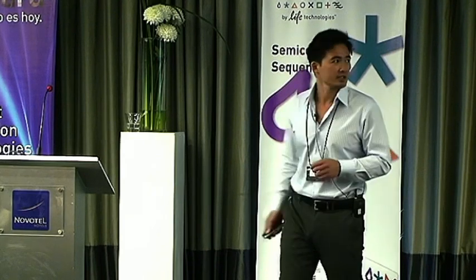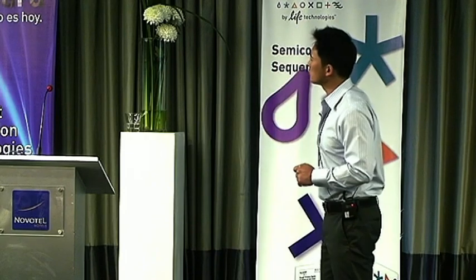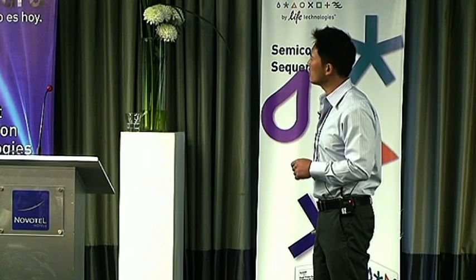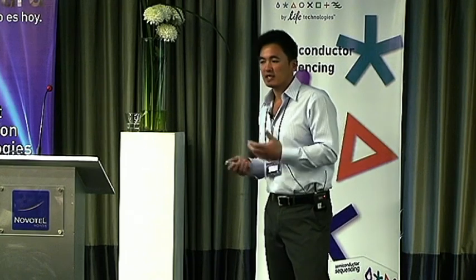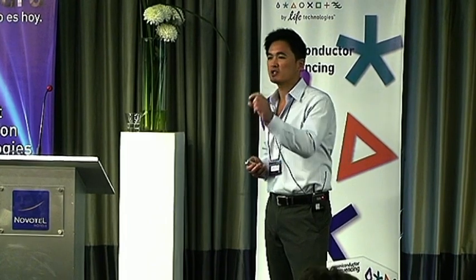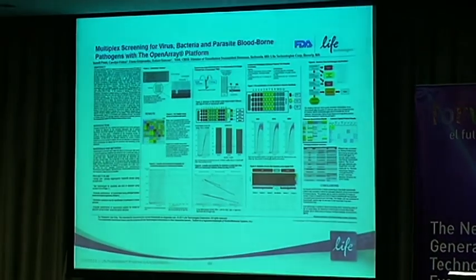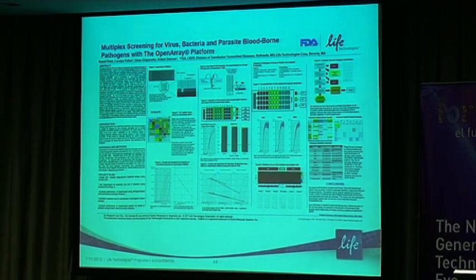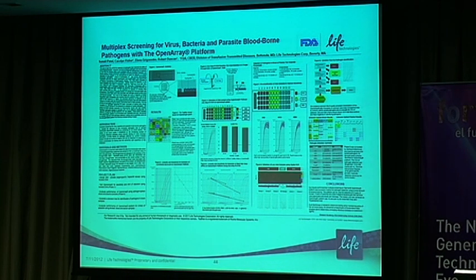And again, I'm still testing your eyesight here with more posters. But this is a recent poster with a collaboration with the FDA back in the States. So with our company and the FDA, the title is somewhat misleading. It says multiplex analysis of pathogens. So we're not actually multiplexing the assays within the wells. They're saying multiplex in the sense that we can do the equivalent of multiplexing, but basically do these as singleplex assays in a high throughput format. So basically it enables us to, let's say, spatially multiplex, geographically multiplex on the array, without having to try to get all these different assays to work together.